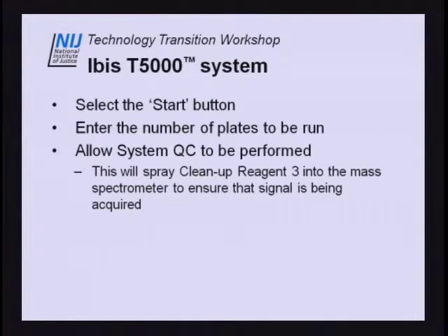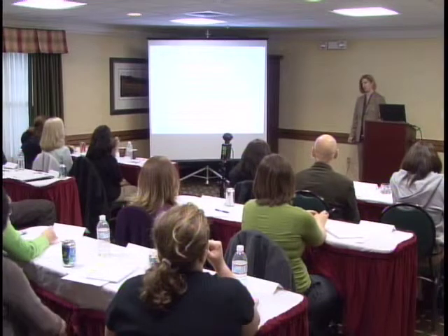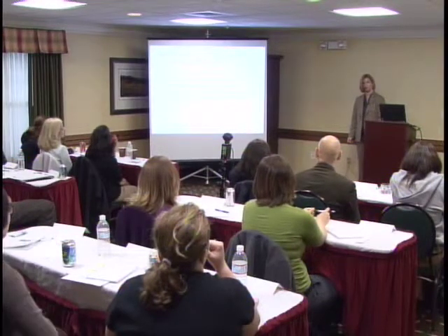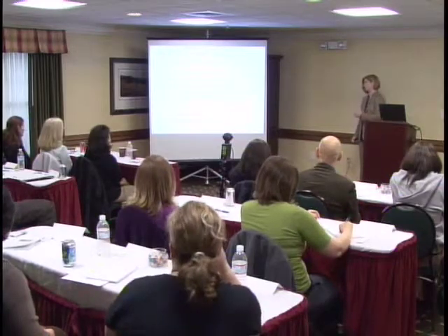Once you hit the start button, you'll be asked to enter a number of plates to be run. You can put anywhere from 1 to 15. The next question will be, do you want to allow a system QC to be performed? If you're running your instrument every day and starting every day, you don't need to do this every day, but if you've gone over the weekend and haven't run it, we recommend doing it at the beginning. This ensures that you're actually still getting mass spec signal and that it's being acquired and that your CR3 reagent is looking good.